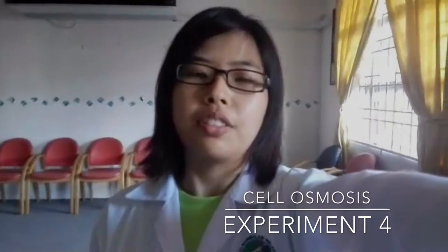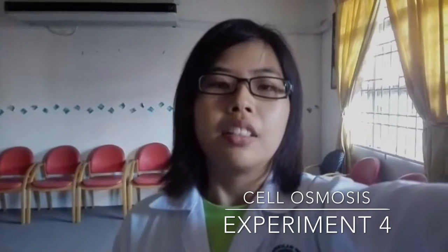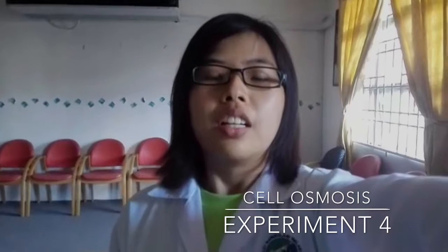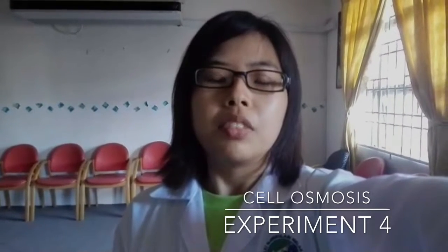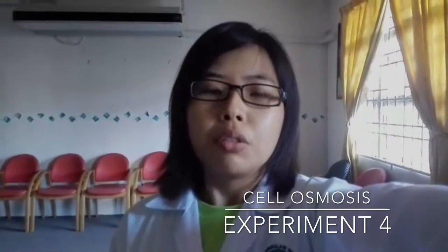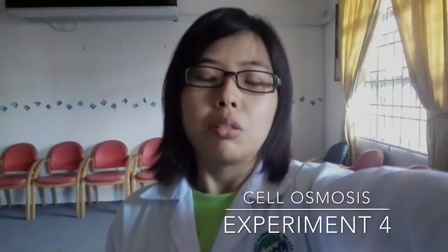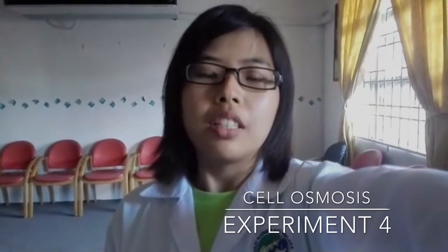The title of this experiment is cell osmosis. Osmosis is defined as the movement of water down its concentration gradient across a semi-permeable membrane to achieve osmotic equilibrium. When erythrocytes are placed in various concentrations of solution, the osmotic equilibrium will change due to the movement of water molecules. Therefore, when a solution is hypertonic to erythrocyte, the erythrocyte will undergo crenation where the cell shrinks. This is because water diffuses out of the cell and enters the solution to achieve a new osmotic equilibrium.